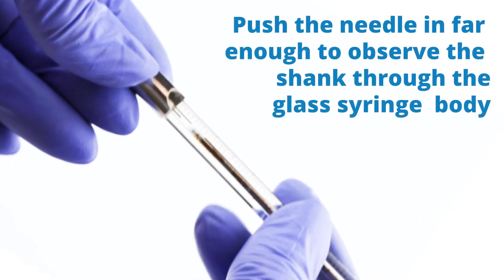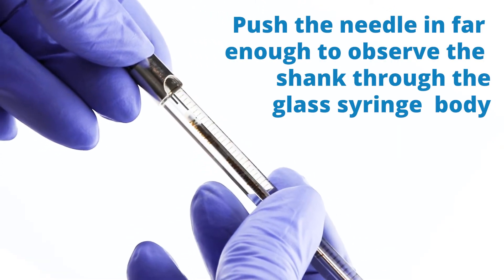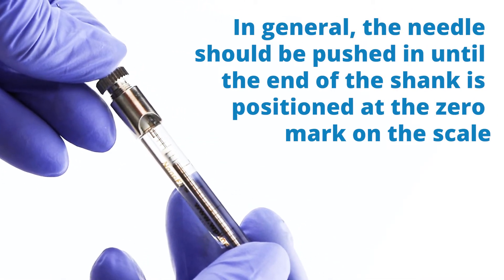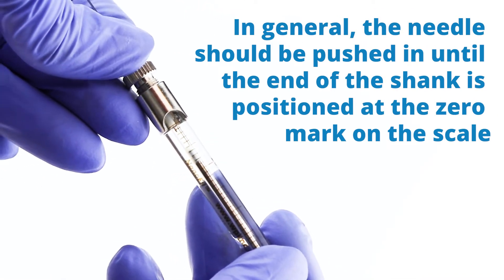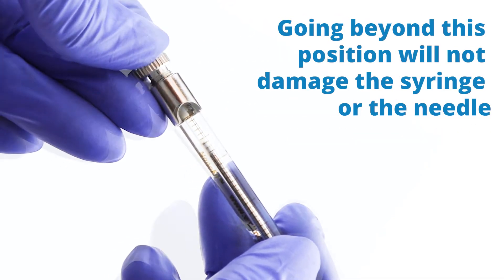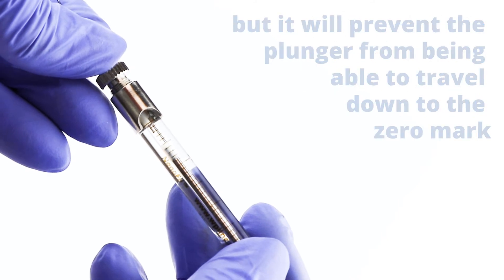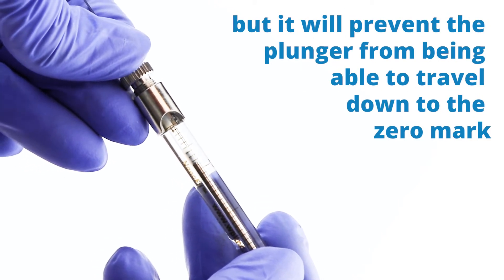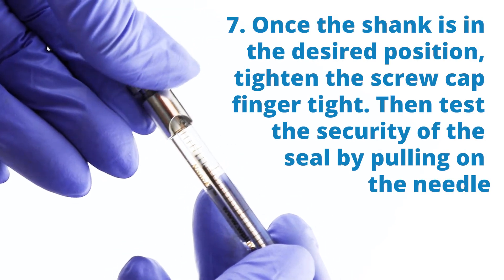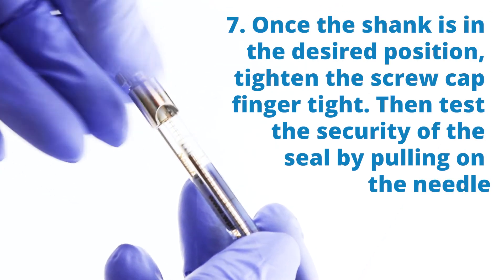Push the needle in far enough to observe the shank through the glass syringe body. The needle should be pushed in until the end of the shank is positioned at the zero mark on the scale. Going beyond this position won't damage the syringe or needle, but it will prevent the plunger from traveling all the way down to the zero mark. Once the shank is in the right position, tighten the screw finger tight.